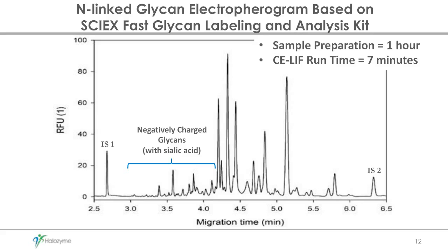Of course, you want to confirm that it is accurate, but in a couple of hours, you can have a full idea of what your major glycans are, and even the smaller ones, because it allows you to zoom in and look at the smaller peaks. I'll show you some of our data, but we were able to count up to 80 peaks on this profile. So it can be very, very powerful when you're trying to do characterization and identify some of your smaller peaks.